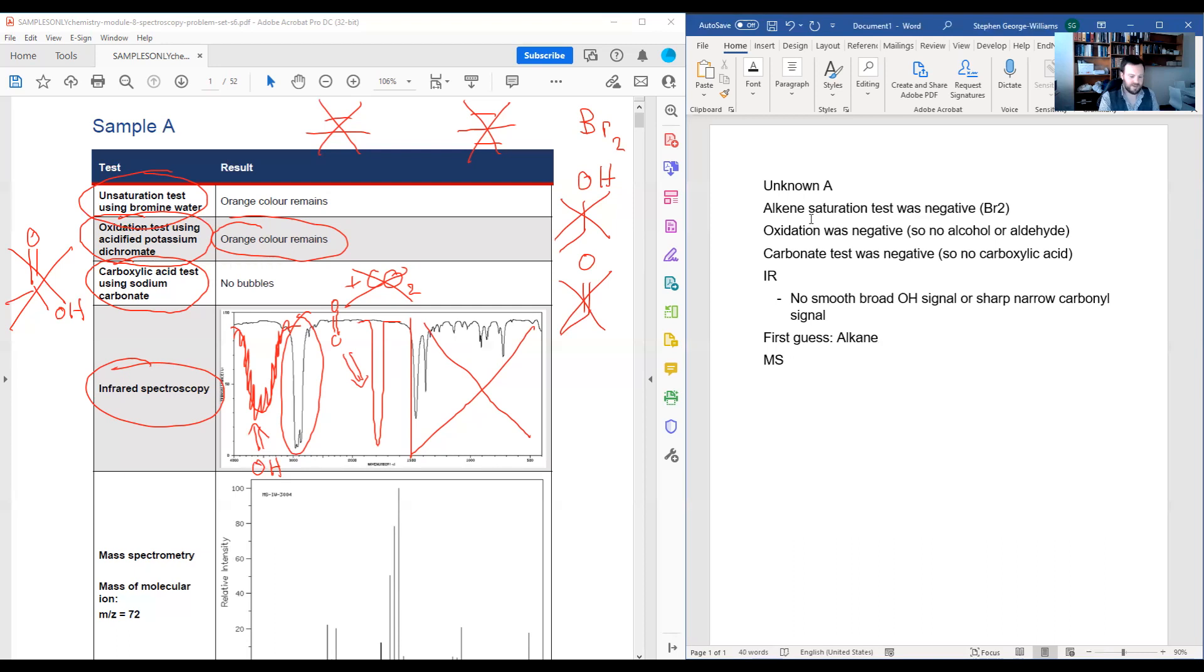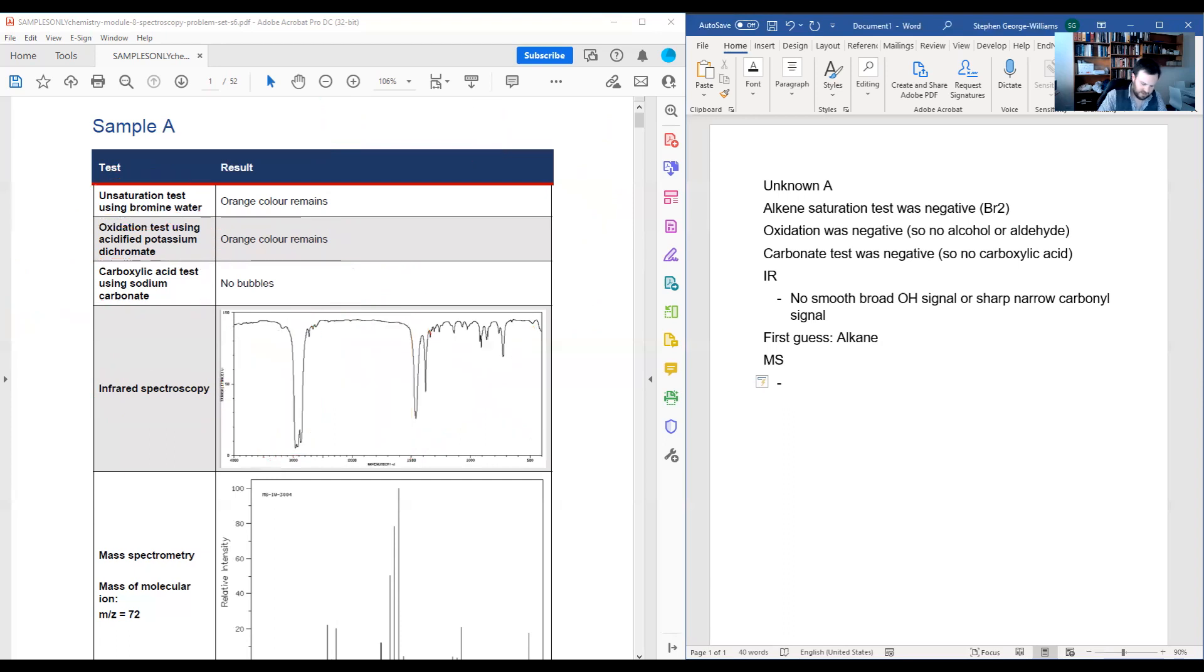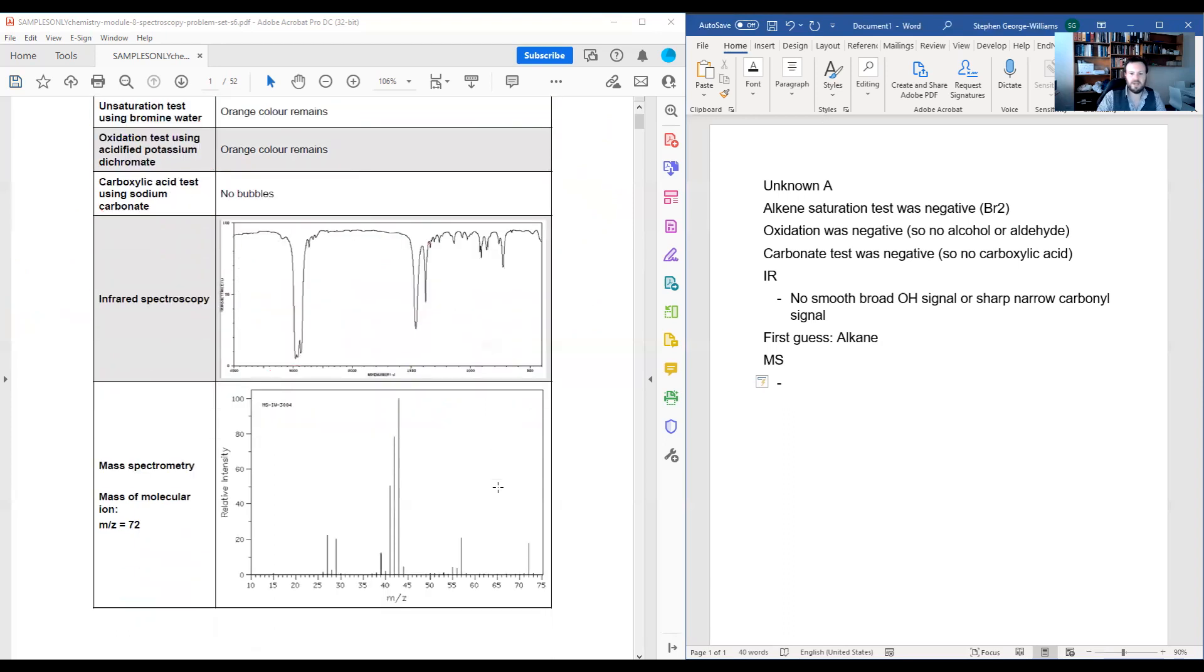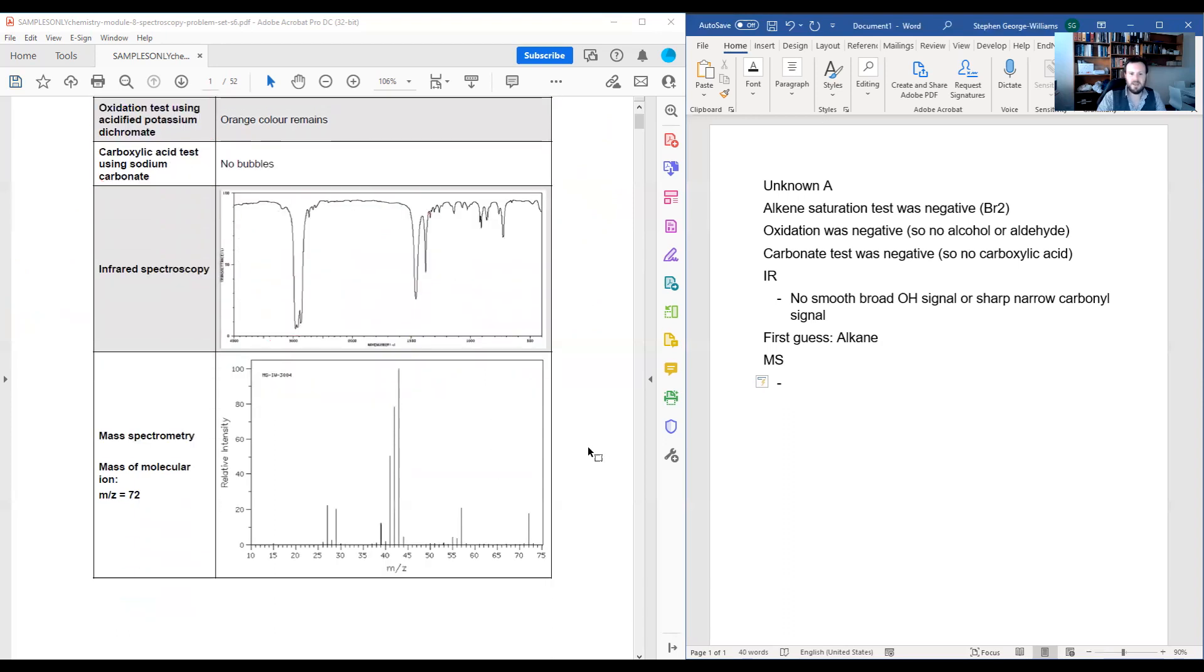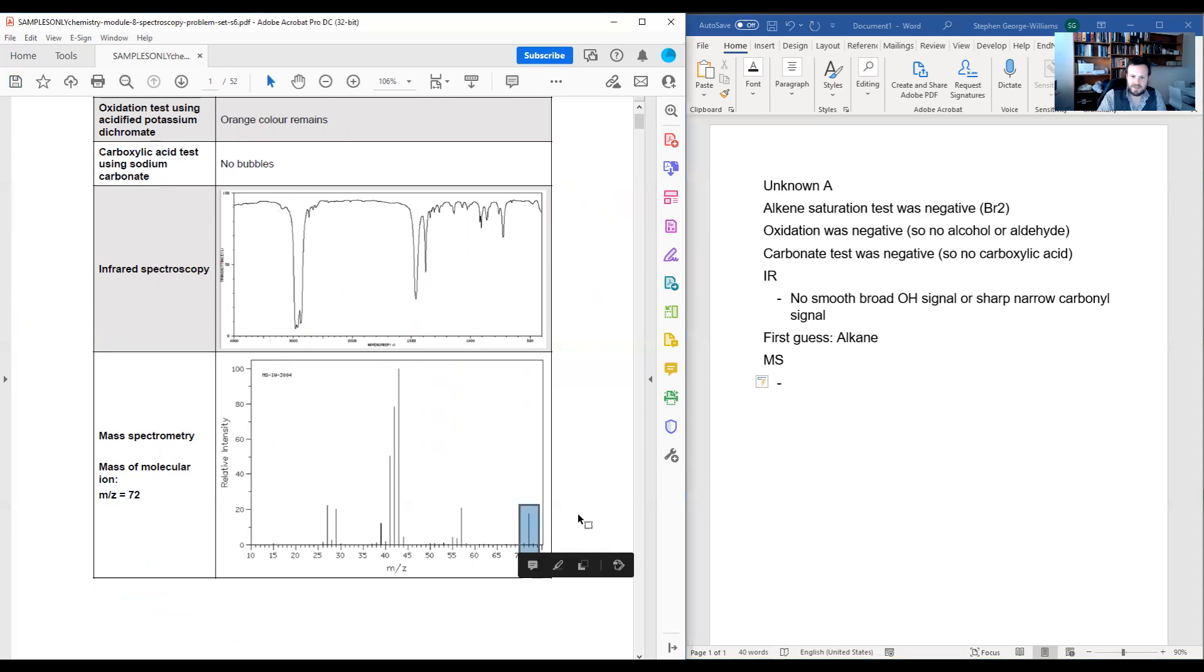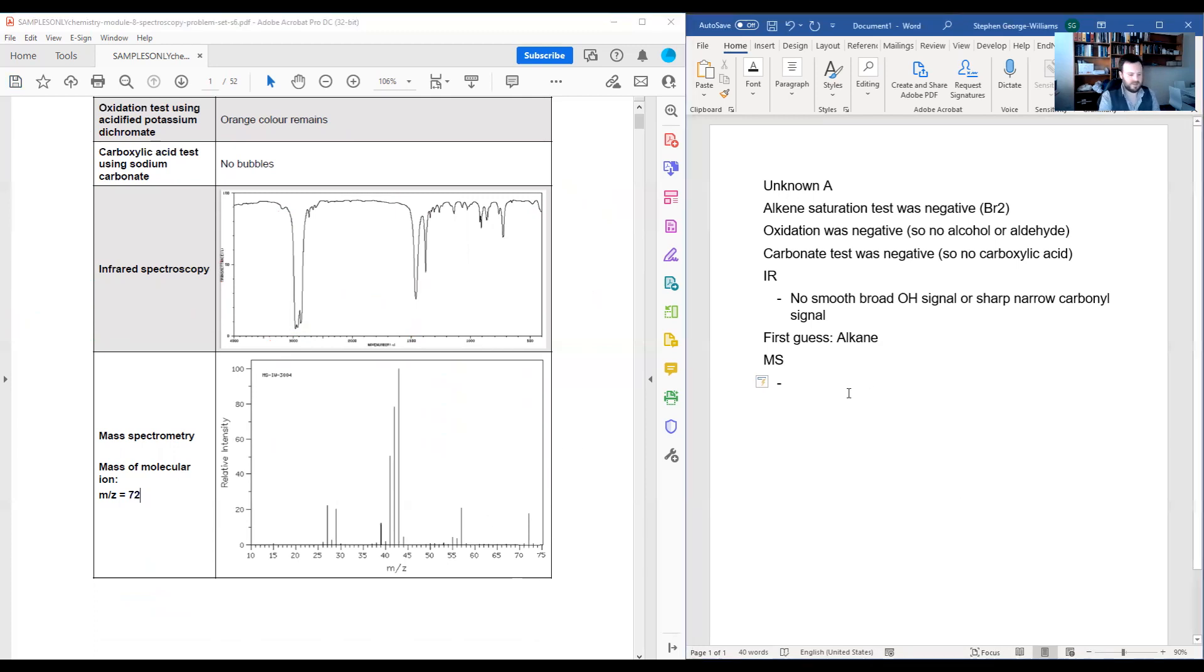With regards to our next test, which is our mass spectrometry, I'm just going to clear my writing off the screen and scroll down a little. And so here we have our mass spec. At the moment, I can see that there is a peak at about 72 as my molecular ion. I can read that off to the left here as well. So I will say that my molecular mass equals 72 grams per mole.